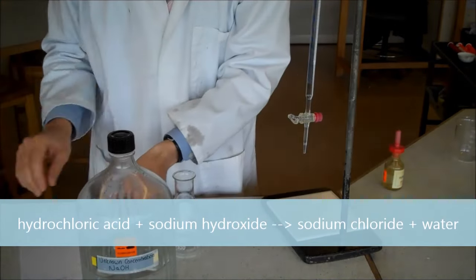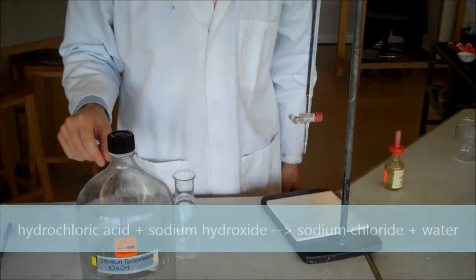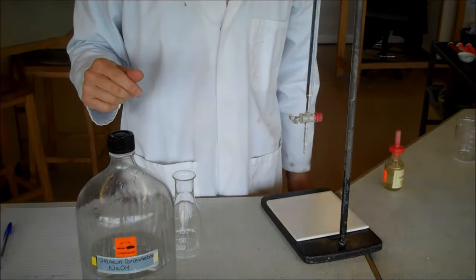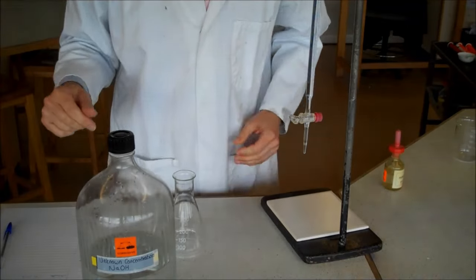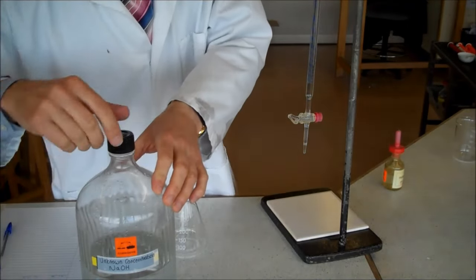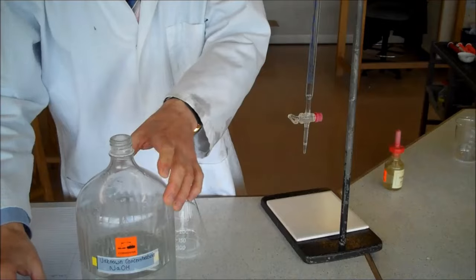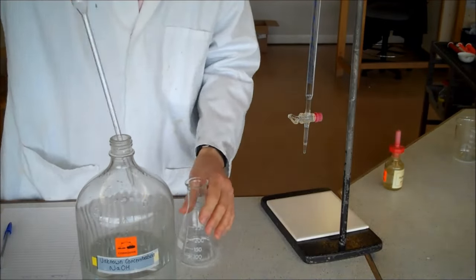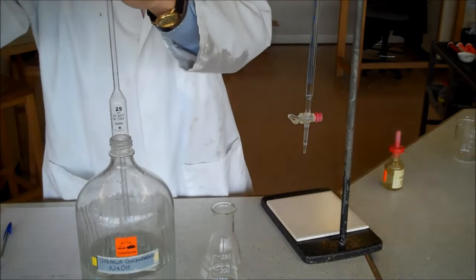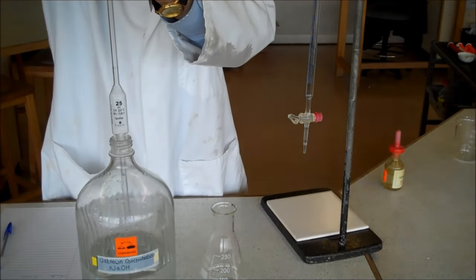If we're going to make a salt which is neutral, we've got to have exactly the right amount of acid to neutralize our alkali. Now our alkali here is corrosive, so I've got to wear lab coat and goggles.